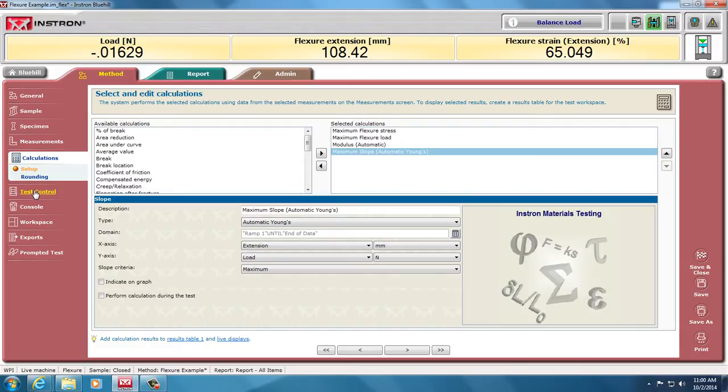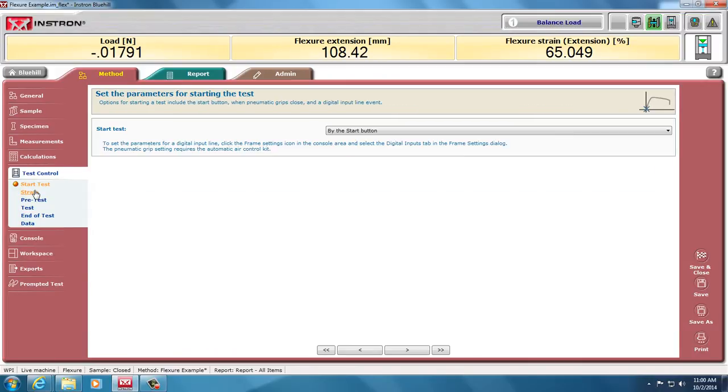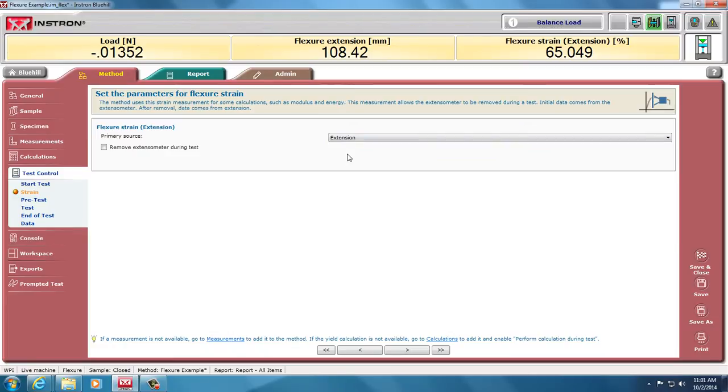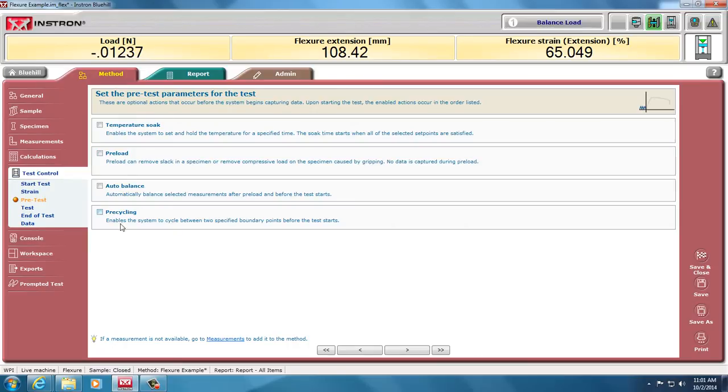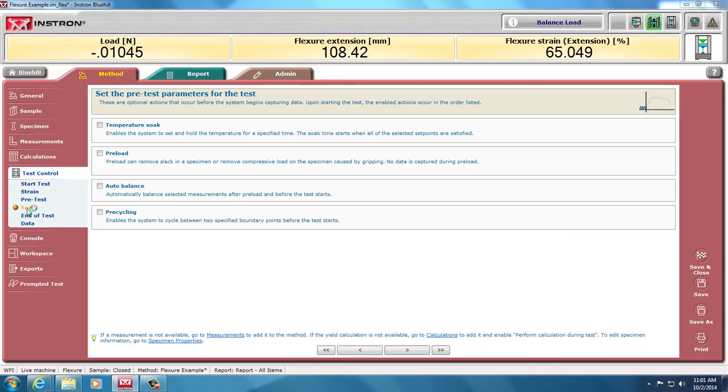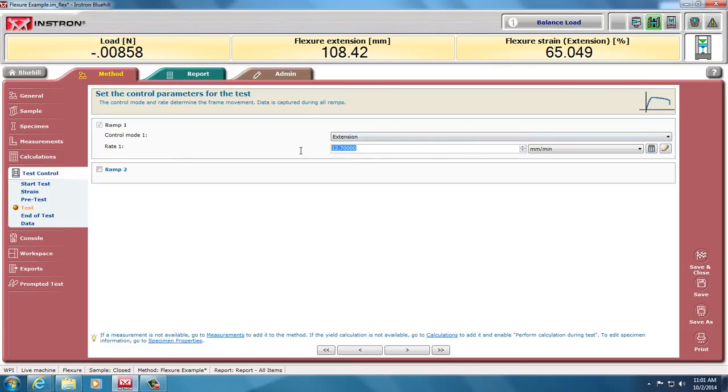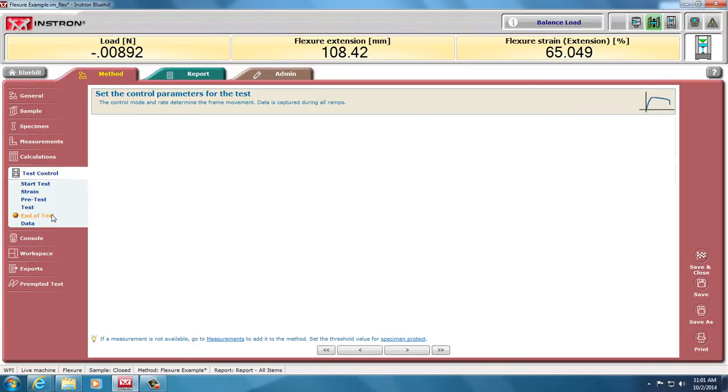It's the same as for any type of test. Then our test control is going to be very similar to uniaxial. I'm going to start it with a start button. My strain is going to be based on the extension. We could be using extensometers or deflectometers. In four-point bending, they suggest using a deflectometer. But in three-point bending, extension should be fine. Pre-testing is very similar to uniaxial. Also, we can do a preload, auto-balance, and pre-cycling. And the test is where flexure is going to be somewhat different than, and the end of test different than a uniaxial test. Here we'll just use extension millimeters per minute. I'm going to put that to 100.